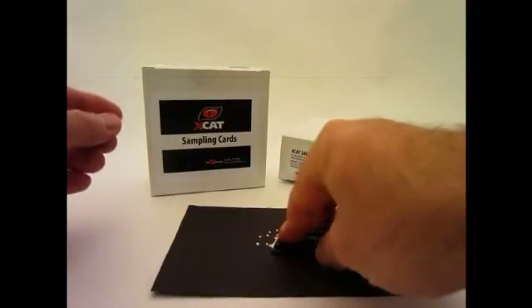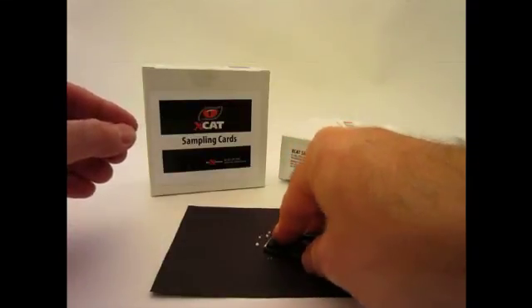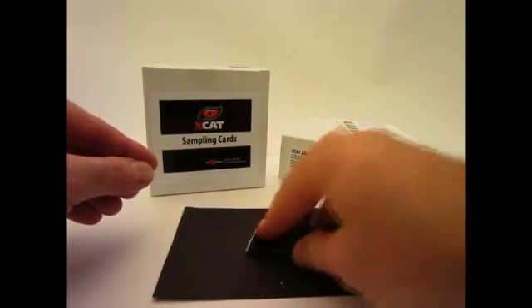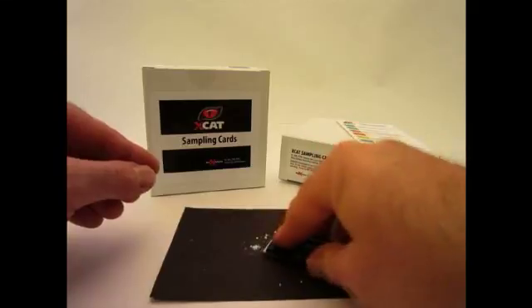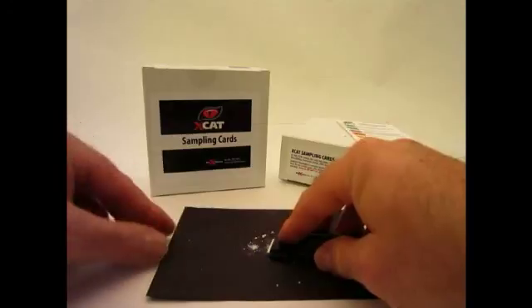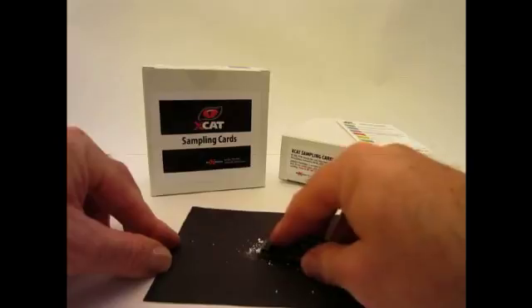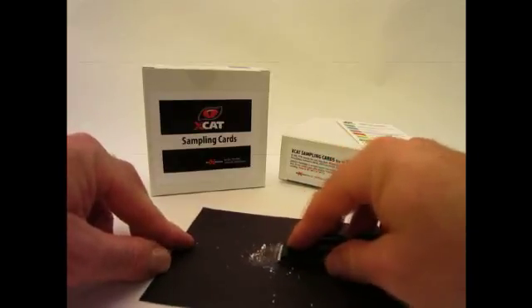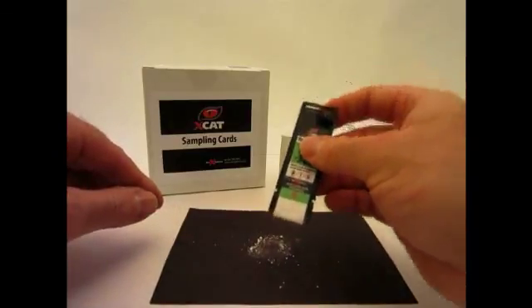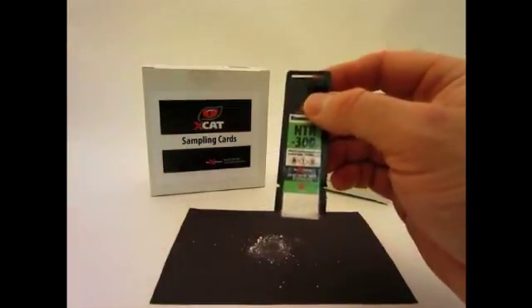Grind the material with firm pressure, but not so hard as to damage the paper. Once the powder has been created, rub the paper in the powder to collect the sample. Tap or shake the card one time to remove any excess dust. The card is now ready to be analyzed by the XCAT.